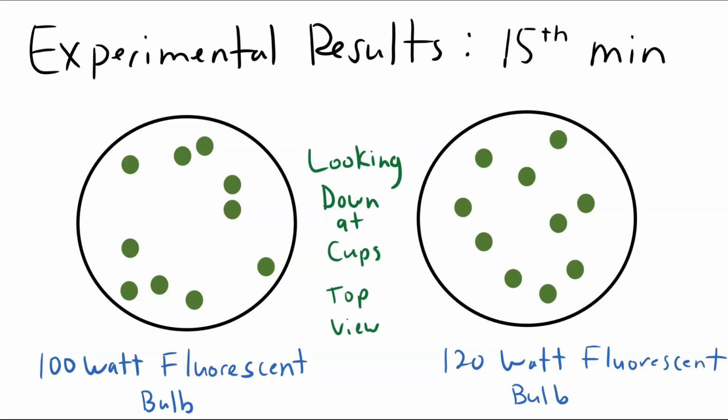So now you're done with experiment 2. Make sure your data table is filled out so that you can construct your graph that shows the rate based on estimated time of 50% of discs.